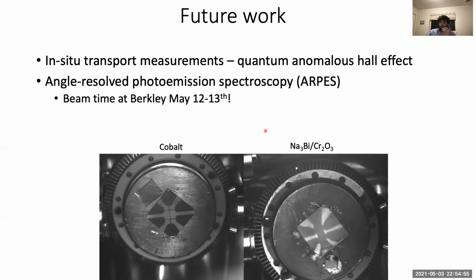So now I'll be talking about the future research coming up. Since sodium bismuth is air sensitive, all of our characterization must take place under ultra high vacuum as well. That is why postdoc Igor Pinchuk has built an in situ chamber where we can perform various transport measurements all while under ultra high vacuum. This is super cool because we can take the samples we grow in MBE and put them on what I like to call the sample highway, which is essentially an ultra high vacuum cylinder that we're able to move samples across, directly into the area in which we characterize them.